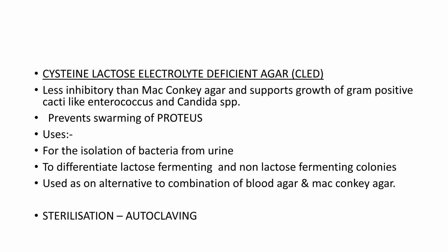Now we are going to study cysteine lactose electrolyte deficient agar. This is also called CLED. In the laboratory, basically for urine culture, we specifically recommend cysteine lactose electrolyte deficient agar. It is less inhibitory than MacConkey agar and supports the growth of gram-positive cocci like Enterococcus and Candida species. So it can also be a differential media as it helps to differentiate between lactose fermenting and non-lactose fermenting bacteria.